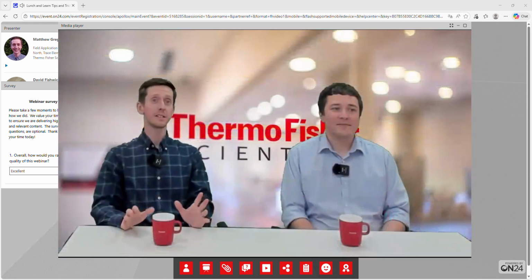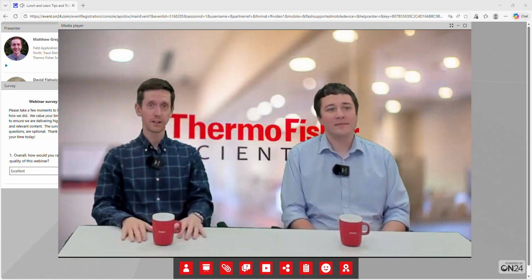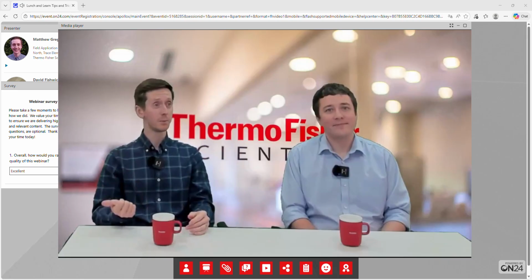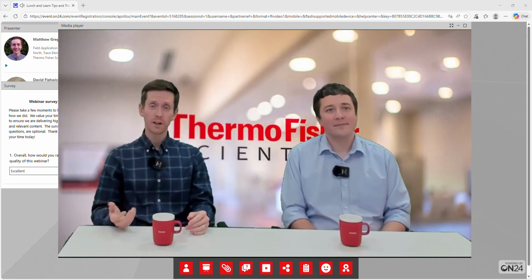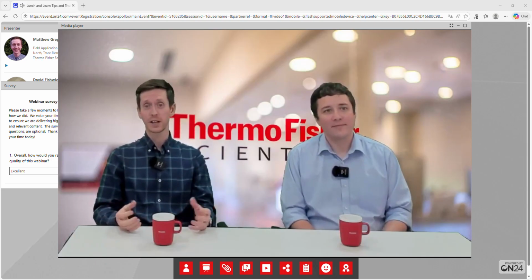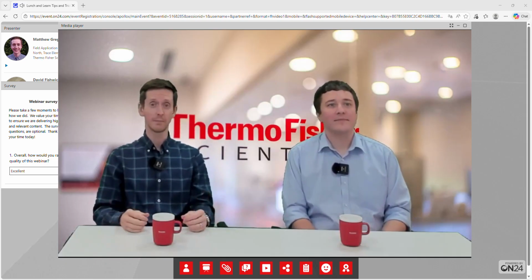So that brings us to the end of part 1 of our qtegra tips and tricks webinar. So today we've covered the dashboard, the get ready workflows, and we've looked at some tips and tricks on how to build your lab book from start to finish and how this can improve your daily lab efficiency.